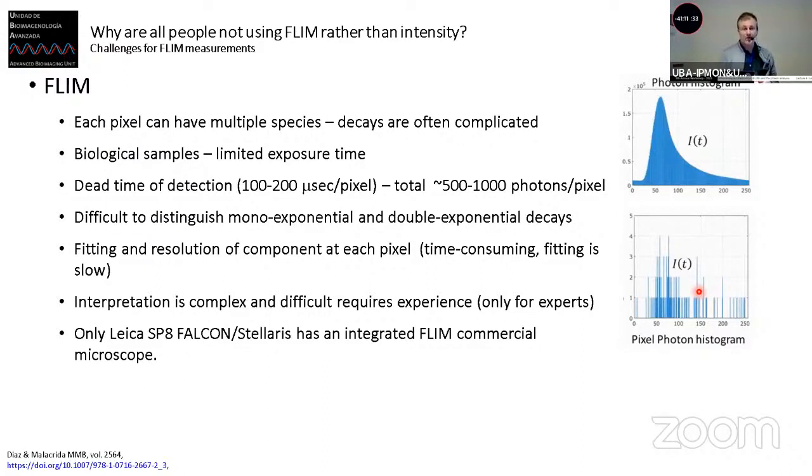And this is the reason why, when you have many more components, let's say 2, 3, or you have reactions like FRET, you have many other situations, well, this can be challenging. And the other important point is, when you have to do fitting, it takes time, and it takes computational calculation. So this is another drawback of the fitting. And at the end of the day, basically, we end up having a technique which requires a lot of expertise.